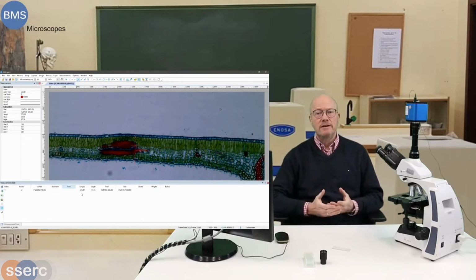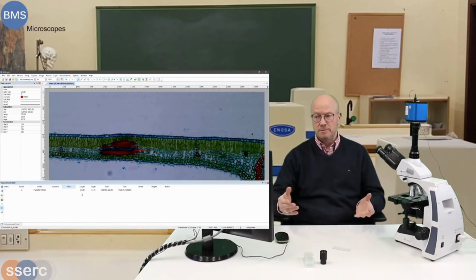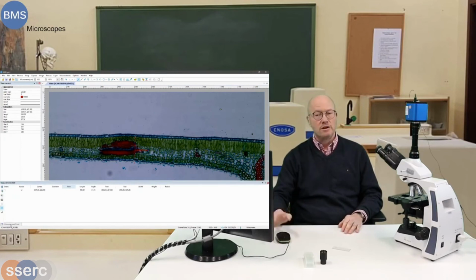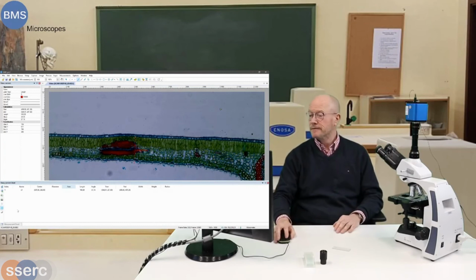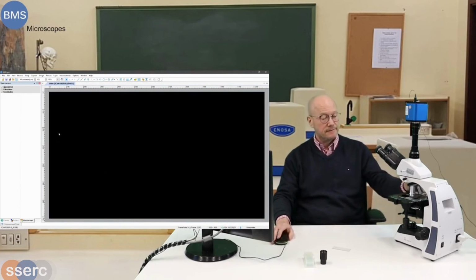It's not the right measurement done there because I have the wrong objective. The objective was a 10 times. We can correct ourselves straight away, and it now goes back again to the 150 micrometers that we were supposed to measure. We lose this value again also, and we go now to the 40 times.